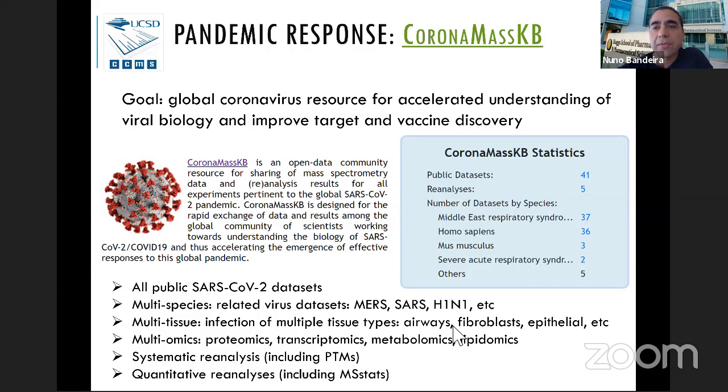I would also like to mention that if you're interested in reanalyzing data that was submitted to PRIDE or to the other ProteomeXchange repositories, but definitely with PRIDE, we can automatically import the data into MassIVE, so you can do the reanalysis and the comparisons, and you can add it to MassIVE.quant.